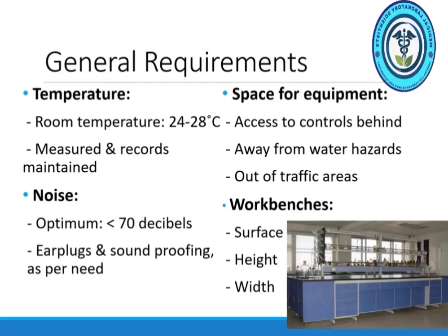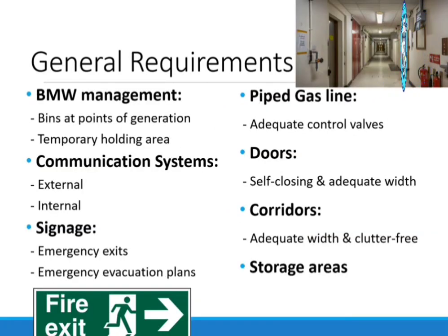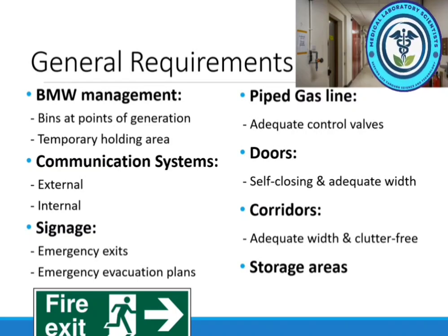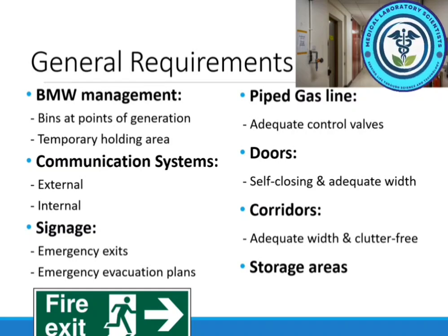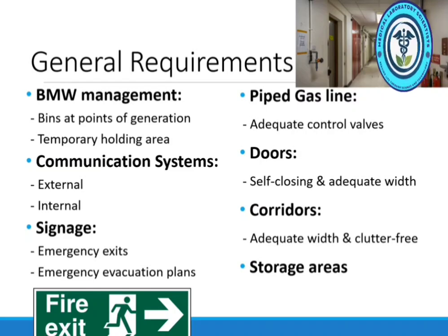The workbenches in a laboratory must be made of impervious material with a smooth surface. They should be of convenient height and width in accordance with the work done on that workbench. Biomedical waste management. Adequate colored bins, as per the latest biomedical waste management rules, must be provided at all points of waste generation in a laboratory. There must be a robust communication system, usually with phones, for internal and external communication. Emergency exit signages and emergency evacuation plan must be displayed for all the laboratory personnel.